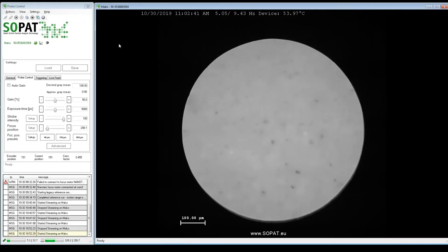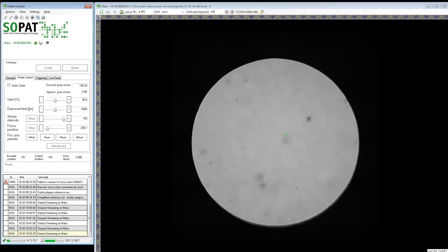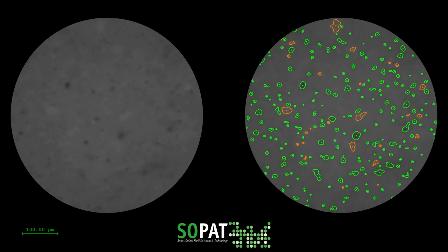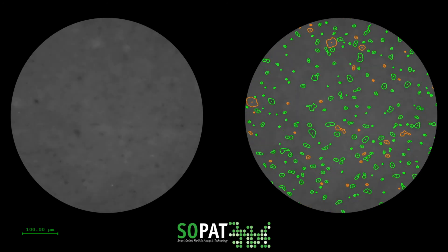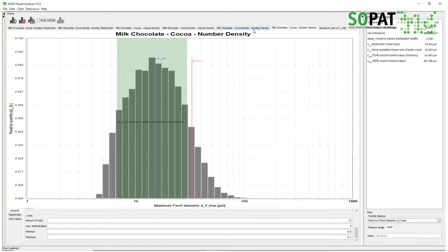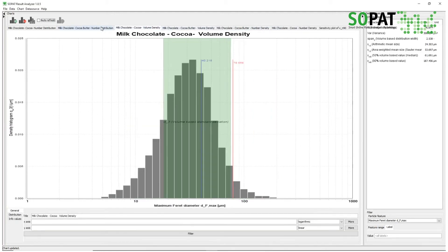To help us identify different particles immediately, we took a screenshot in our live view. In the screenshot we could measure the size of any particle. Our software can automatically take all the particles of interest and classify them into different categories. The result analyzer allows us to extract and explain the characteristic values of the chocolate.